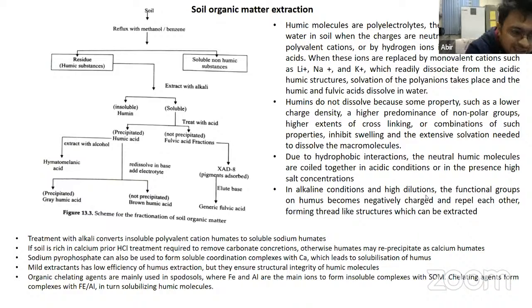So that silicate structure we need to first dissolve. For that, we treat it with hydrogen fluoride, means hydrofluoric acid, and hydrochloric acid, an HF-HCl mixture. So that will dissolve all those silicate materials, and it will be free from clay. So that is the purification of humic acid.